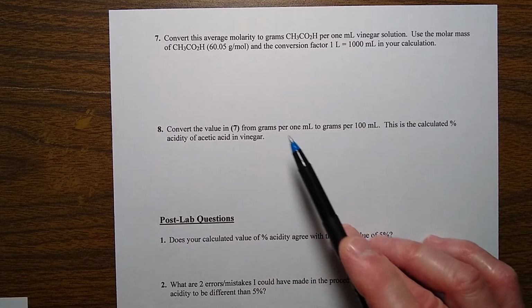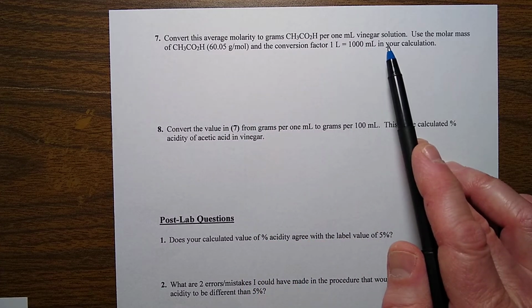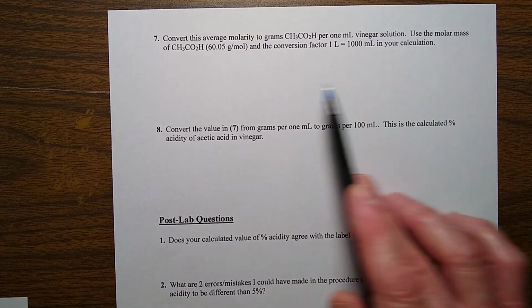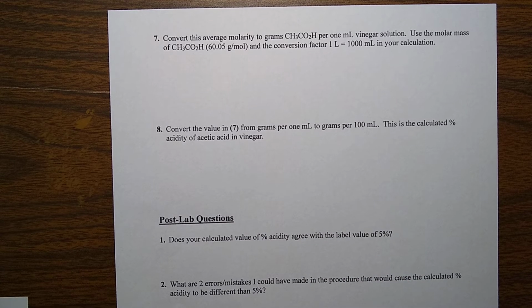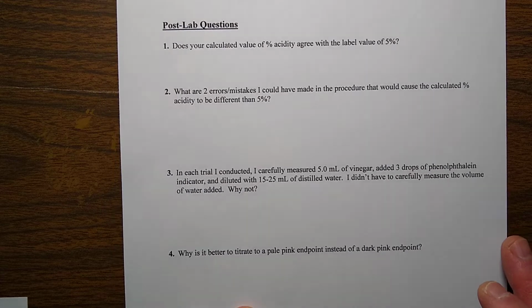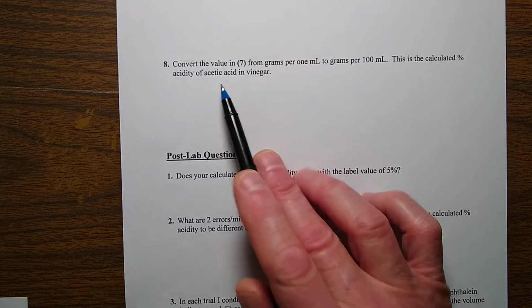This part is a little tricky. Convert the average molarity to grams per 1 milliliter. We're doing that so we can actually convert that to a percent. So steps 7 and 8 in your lab report, again, we'll show you here in a second with some sample data.